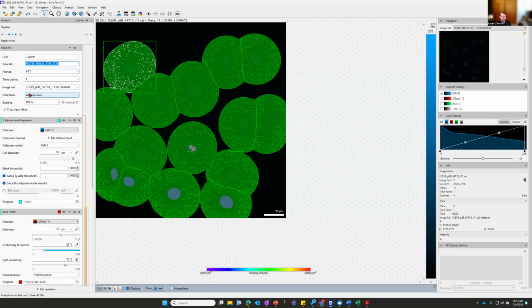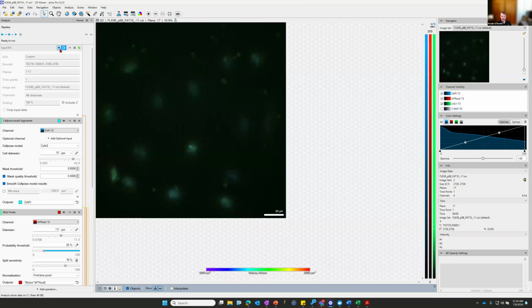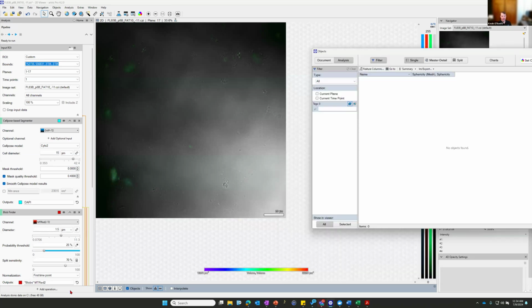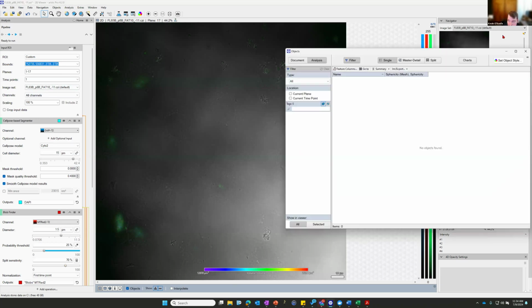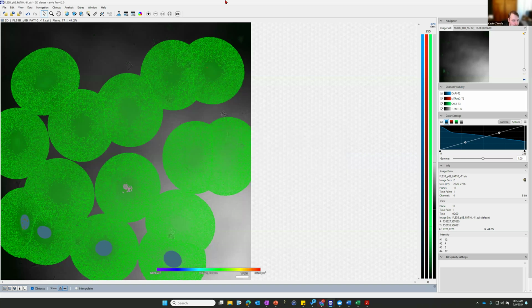All right, and then once we import this data, let me do it really quick there. Actually, let me do it, because once you start it, you're not going to see the objects anymore until you run it all the way. And I see now it's mad at me. Let me pull those back up in a second. Maybe I'll cancel this just to, okay, there we go.